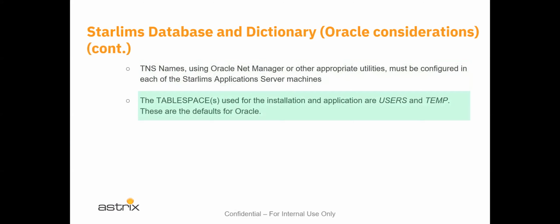Table spaces, again, are referencing an Oracle environment. And the two table spaces, yes, go ahead. Can you repeat again TNS, please?